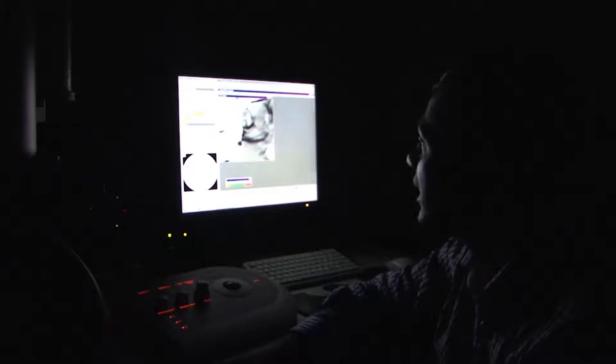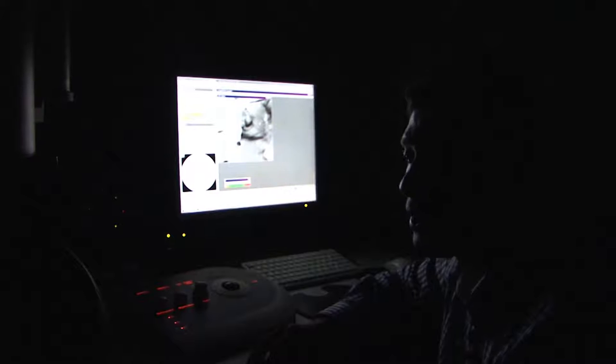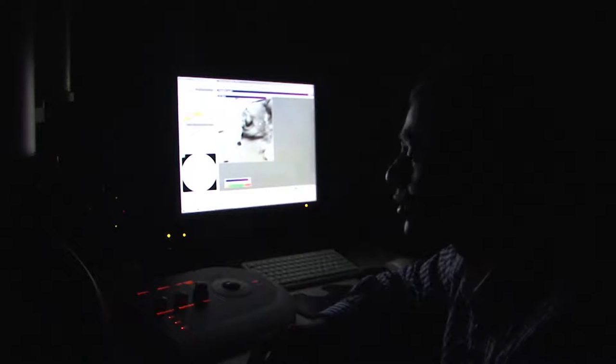The first kind of image is known as a bright field image, in which the transmitted beam or the forward scattered beam is used to image. So whatever intensity information is there in the transmitted beam will be seen on this image. On the other hand, if we use a diffracted beam, then we can see the information regarding a dark field.